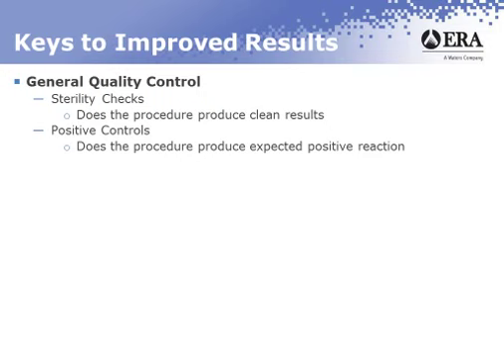You really want to ensure identity, traceability, reference cultures that you're using. You need to make sure that they're coming from some recognized traceable source. There are folks that will use in-house stock cultures that they are maintaining. There's limits to that.